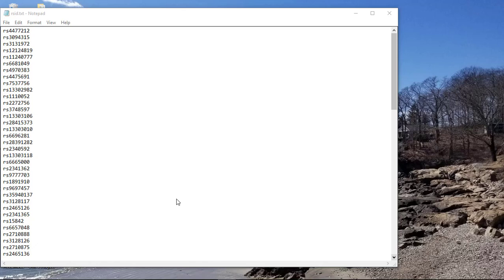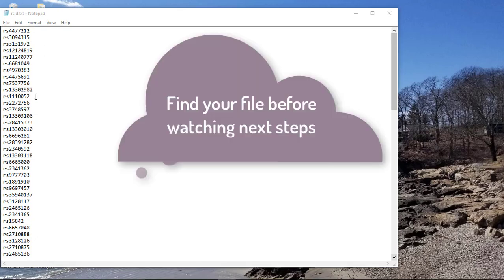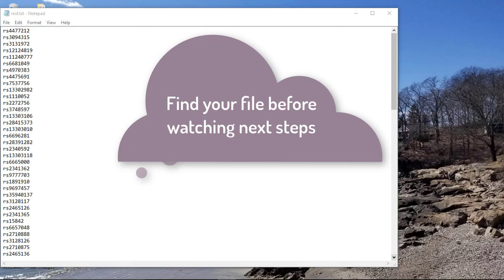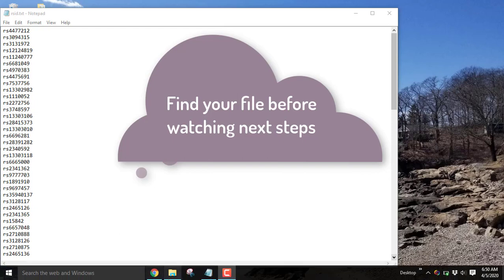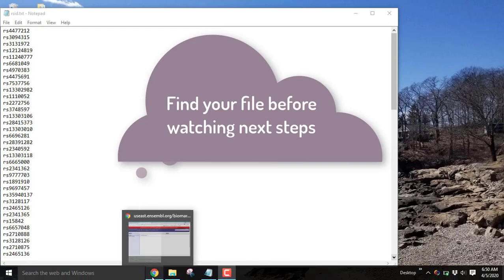Last week you produced a file that looks a lot like the file on my screen, rsid.txt. It's a list of the first 100 RS numbers from a typical 23andMe file. Each of these RS numbers we're going to use today to do a search, so make sure before you watch this video and follow along that you know where your file is. You may have called it call.txt or mycall.txt, but you should have a file from Canvas, and you can always download what you submitted to Canvas onto your computer.